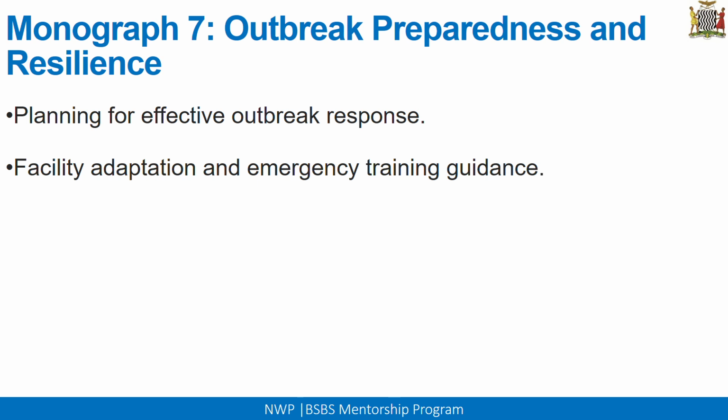So there's that information that this particular monograph will give you in a little bit more detail as compared to the topic that is in the Laboratory Biosafety Manual 4th edition.